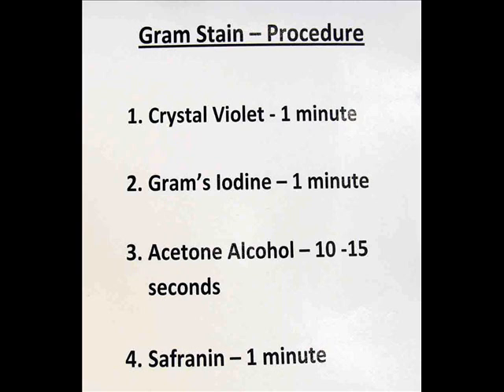Third step is to apply Acetone Alcohol. This is a decolorizer. It will remove the purple stain from my Gram negative bacteria.